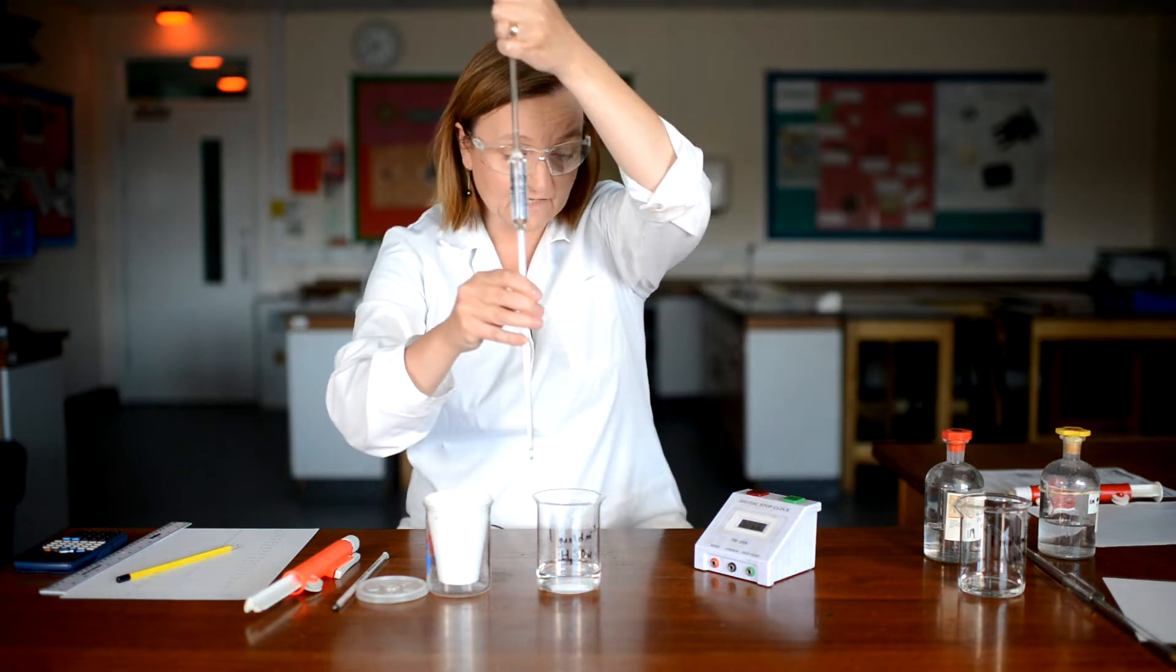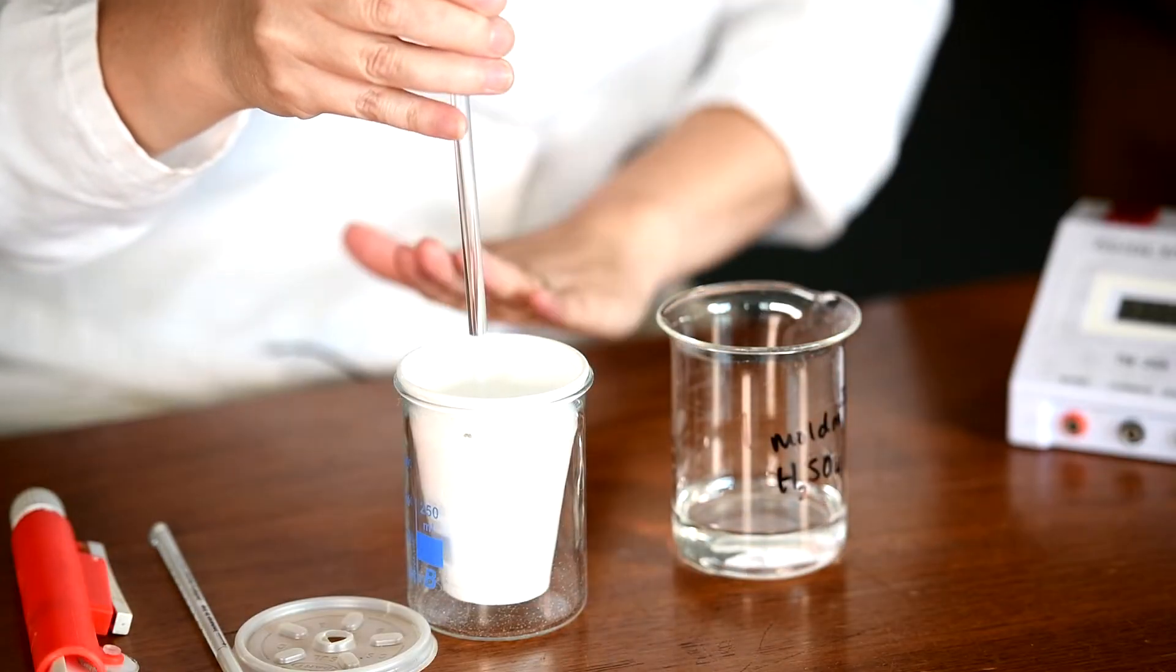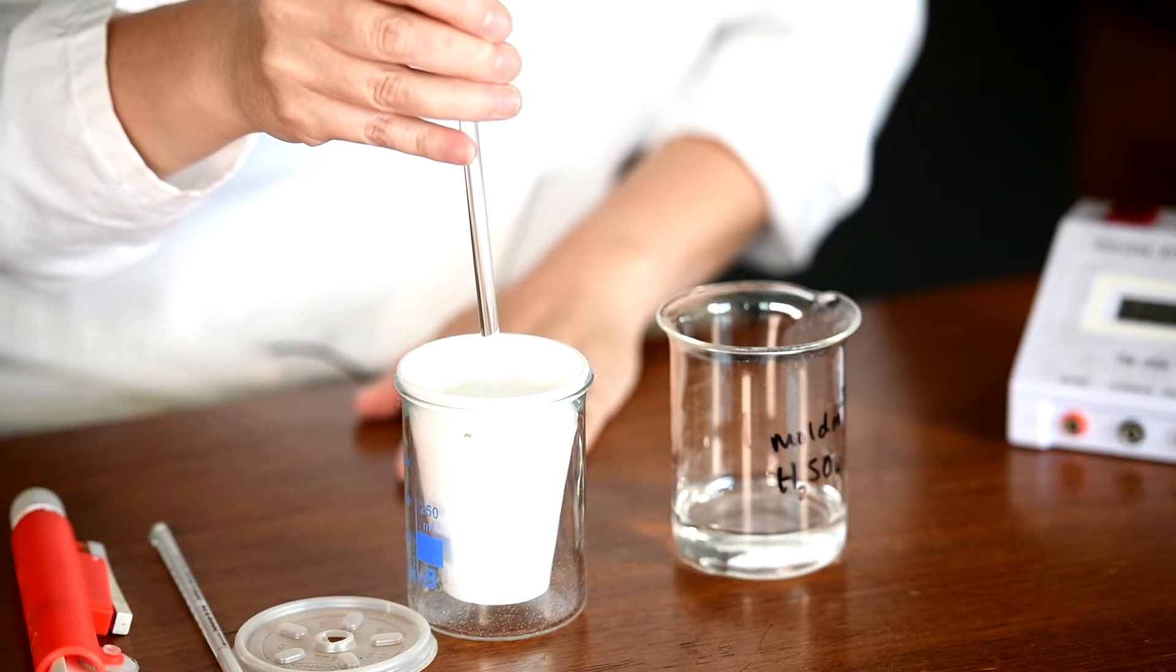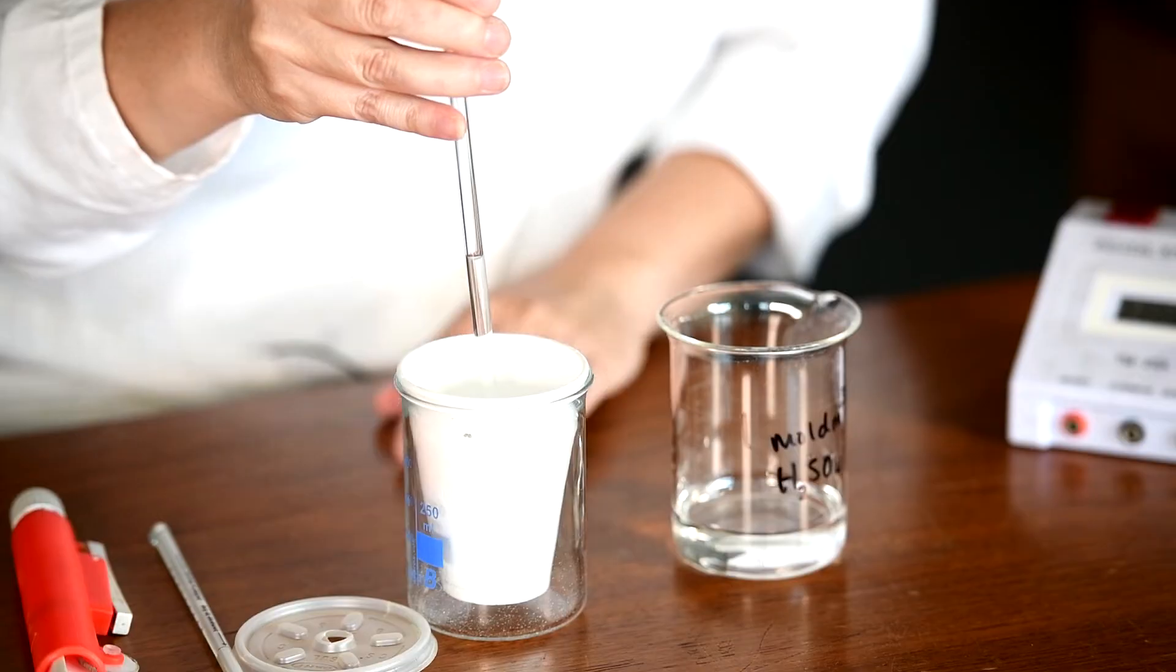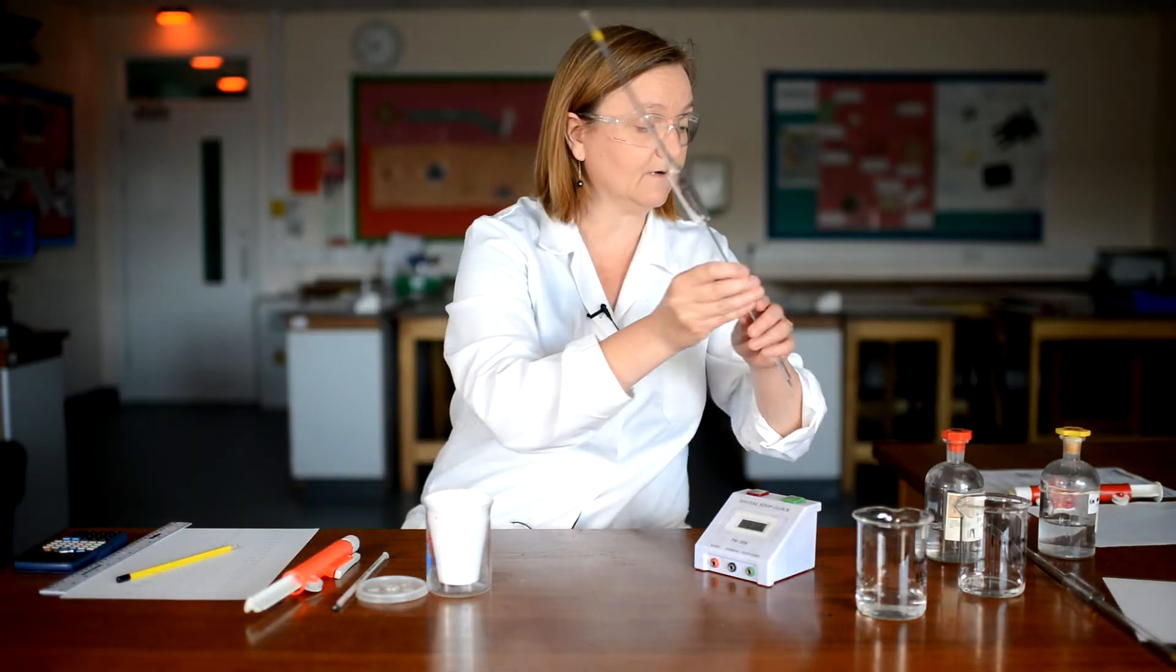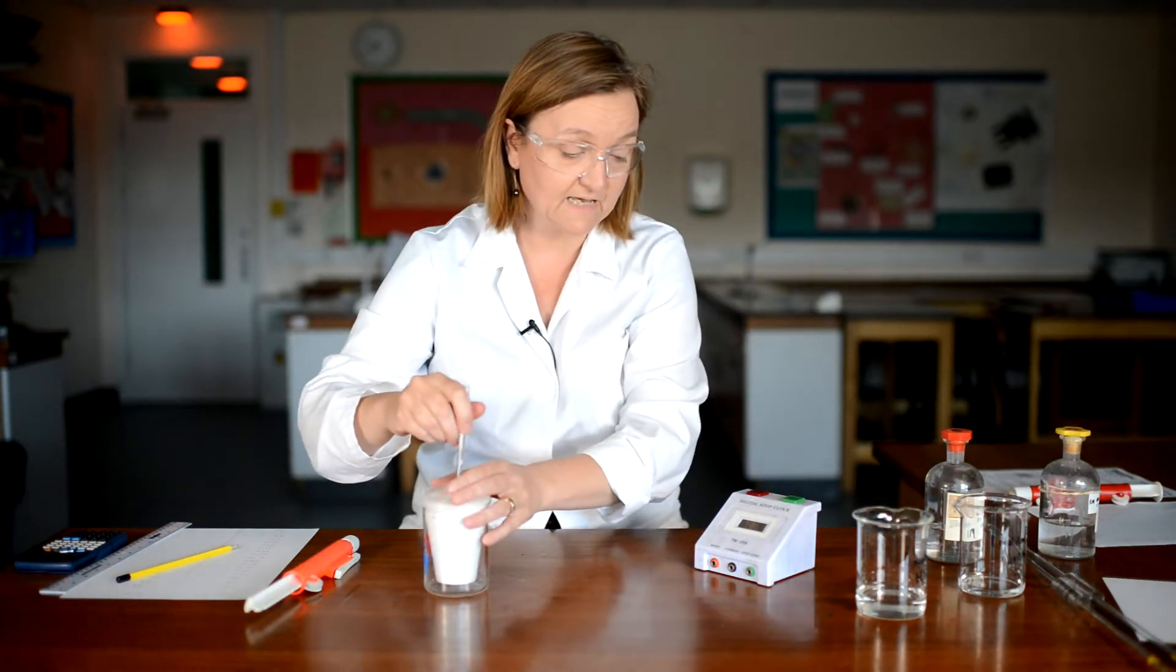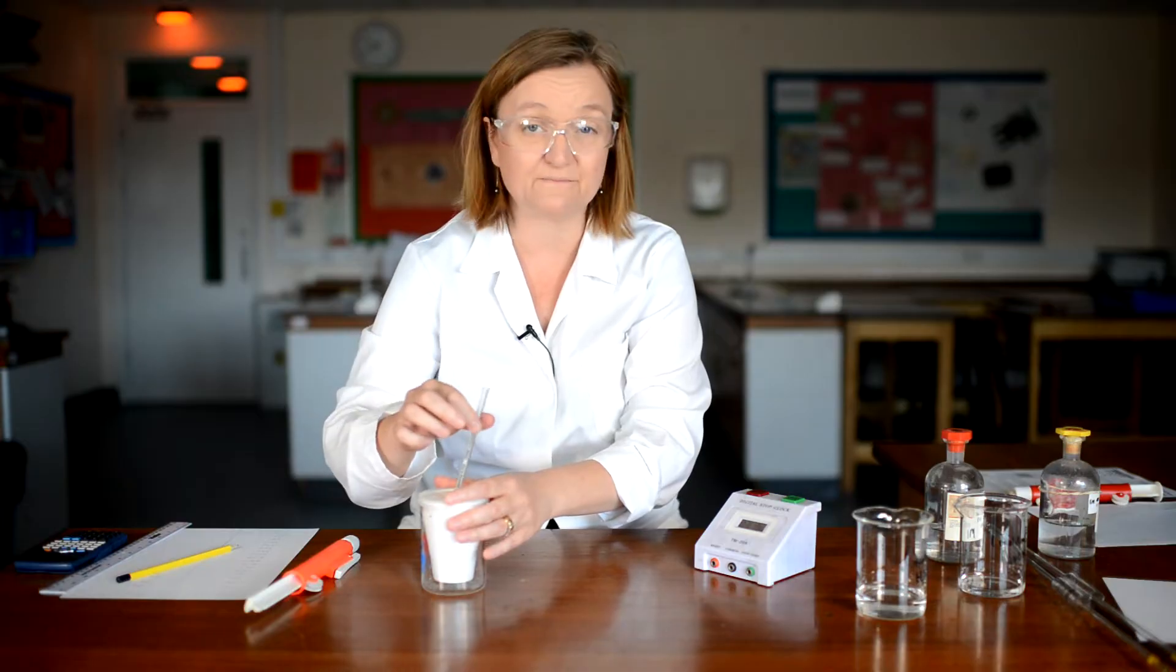And exactly at three minutes, I add my acid to my alkali. Now obviously, I can't take a temperature reading at three minutes, but I know that was the time at which I added my acid. And so now I'm going to pop my thermometer back in. And the next reading I'm going to take is going to be at three and a half minutes.